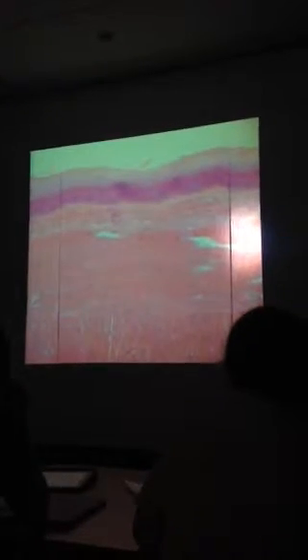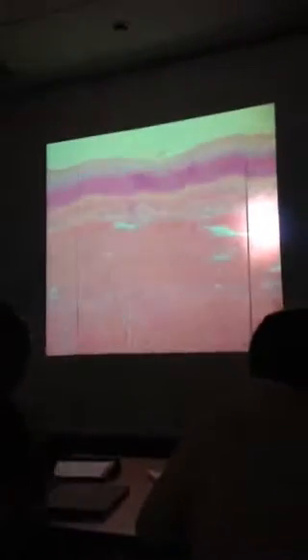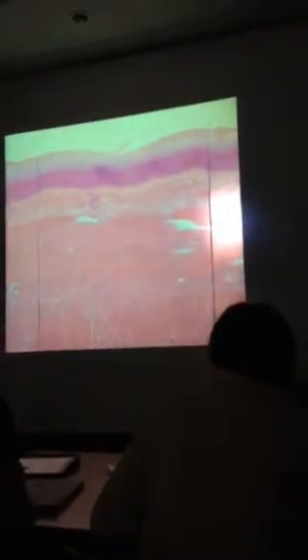All right, now what are we looking at? This is actually non-keratinized stratified squamous epithelium. It actually came from the esophagus. I know this is a slide of the esophagus, but it's got several layers of smooth muscle. And I had two separate pictures. I tried to piece a piece down here because it was much thicker than the slide had. So I didn't make it, you can see the line going across there. But this is a moist stratified squamous epithelium, okay?